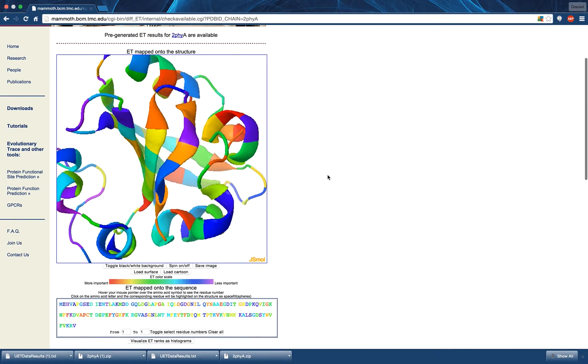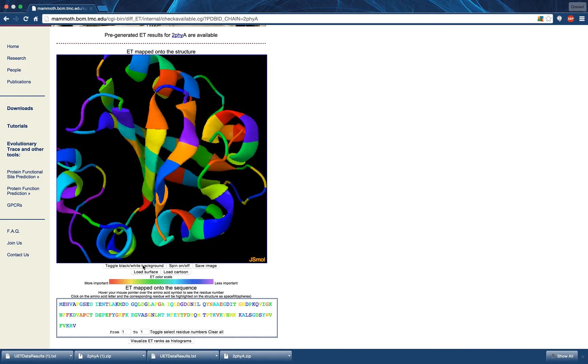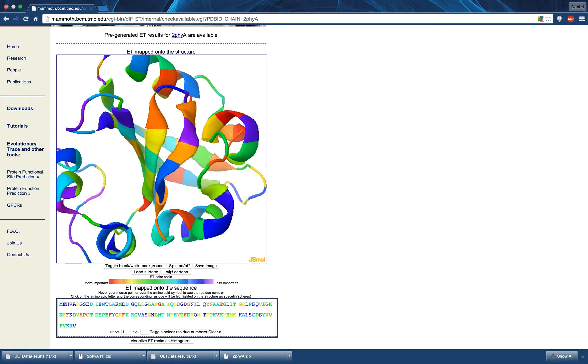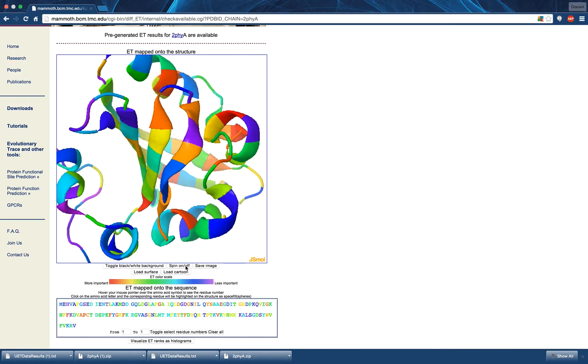By pressing the toggle black-white background, you can change the background color of the structure viewer. By pressing the spin on-off button, you can start or stop the rotation of the structure.